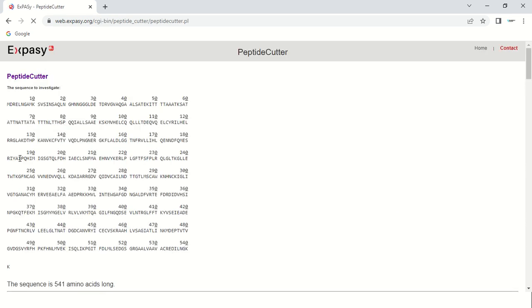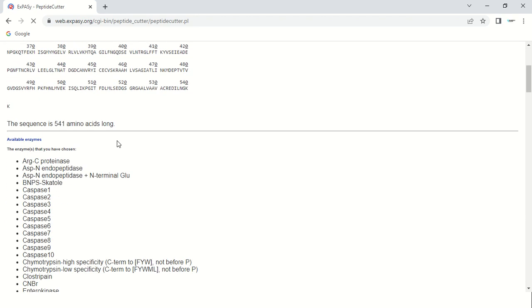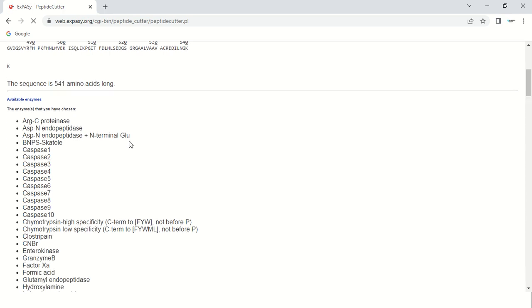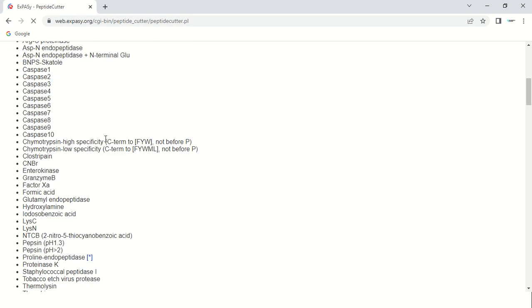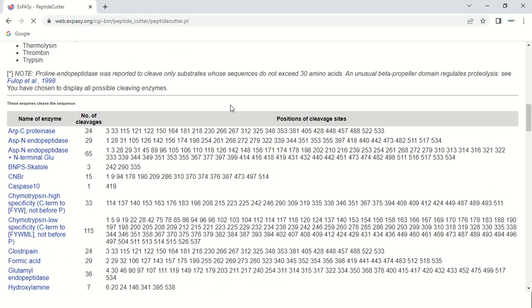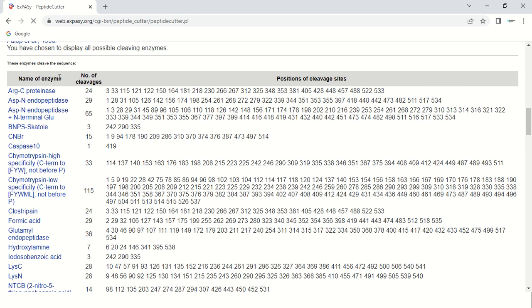After clicking the 'Perform' button, the results will appear. First, you can see the sequence you submitted. Scrolling down, the information shows that this sequence contains 541 amino acids, followed by the main results listing which enzymes cut this protein. For example, the first one is Proteinase K, and the number of cleavages shows it cuts the sequence 24 times. The positions of the cleavage sites are shown, such as at position 3, 115, and so on.